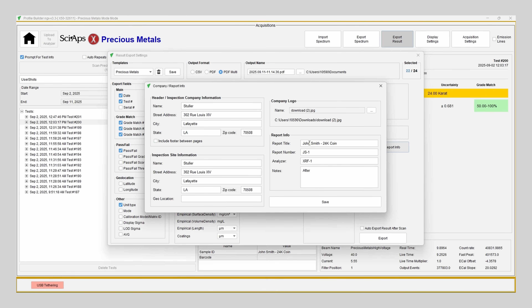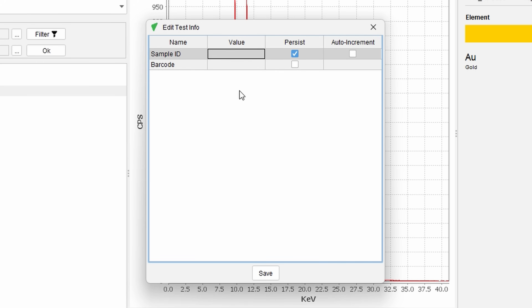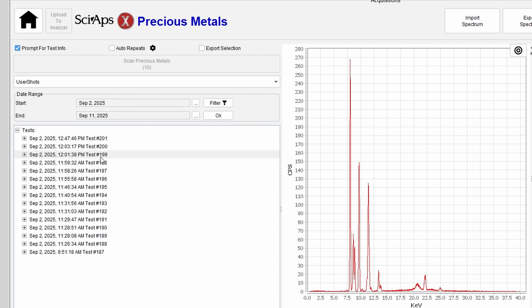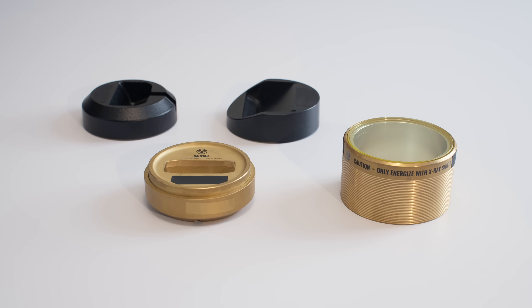It's a great way to show transparency and build trust. You can give each test a custom name, making it easy to find later and keep everything organized. The software also saves a complete history of your scans — great if you're running a busy shop or just want professional records.